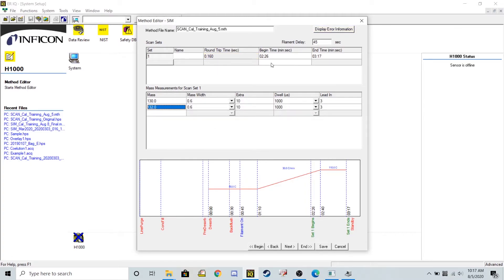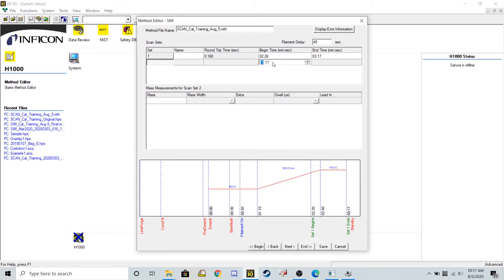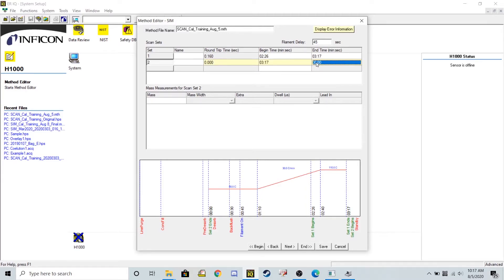For my second window for the mass spec to be open in is where I'm going to search for my tetrachloroethylene. We can start it at 3:17, so right after that first window closes, and we can go just until the end of the method, which is about 4 minutes and 20 seconds.